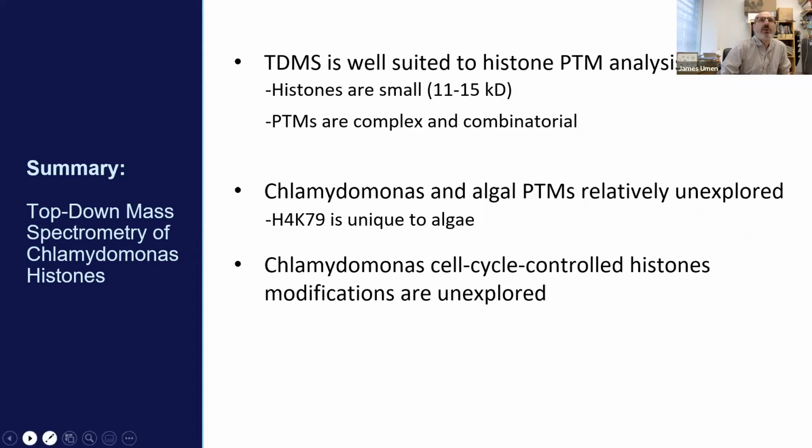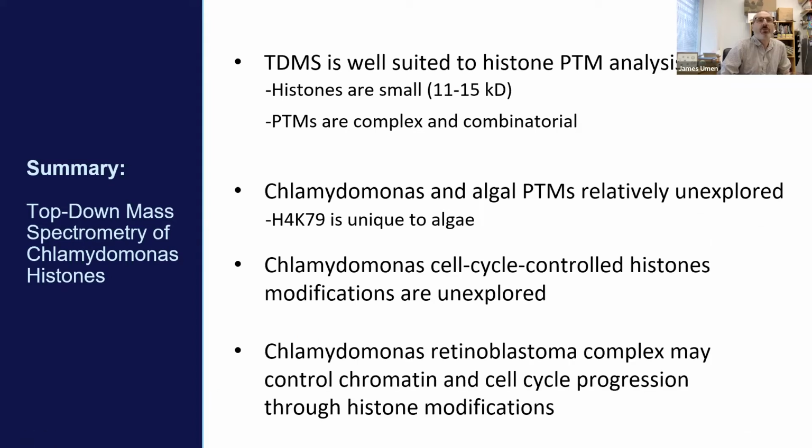And then finally, the retinoblastoma complex may control chromatin and even cell cycle progression through these modifications. And so the biology that we're discovering through mass spectrometry, we think will be very relevant to how cell cycle control works in this organism and maybe other organisms.